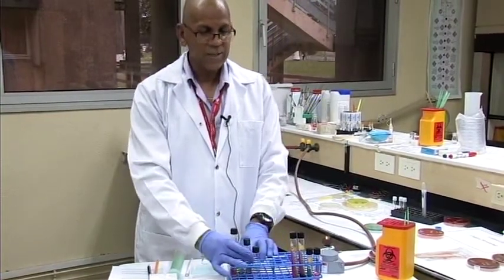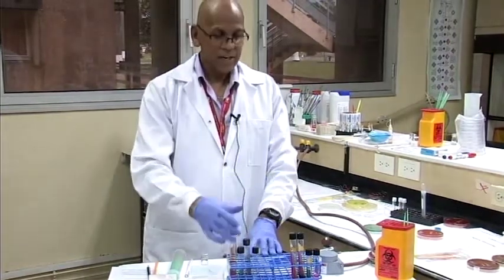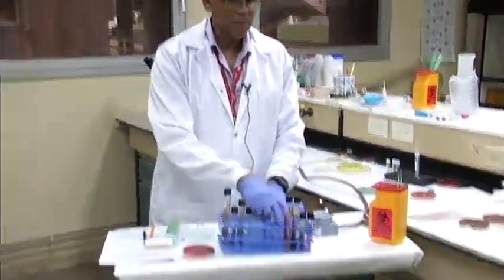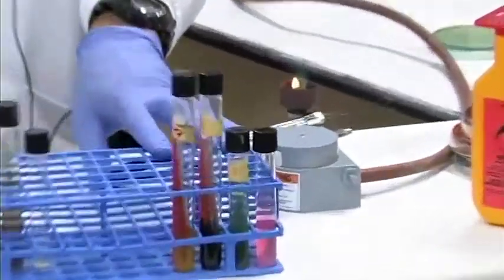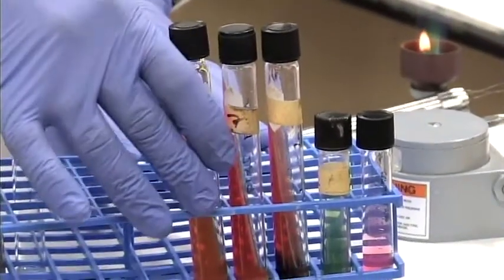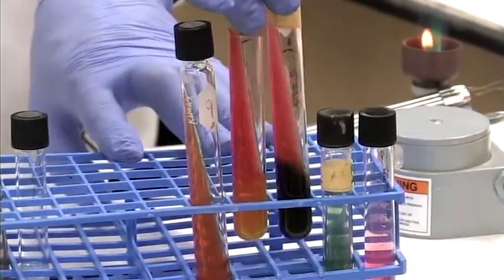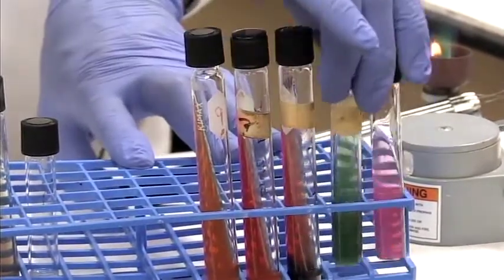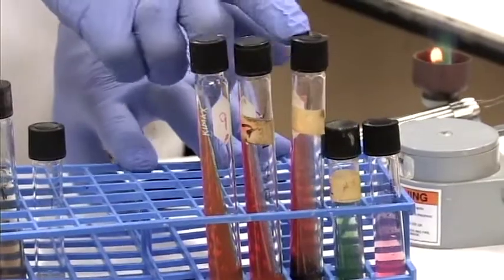And you place these in your incubator overnight for growth again. The next day, you're going to remove them, and hopefully you'll see some reactions like these here. These are positive reactions of bacteria that a TSIA have reacted. So this is a TSIA that is, let's say, negative or without bacteria, that shows no reaction. These are ones that have bacteria, showing you the end products. Right?